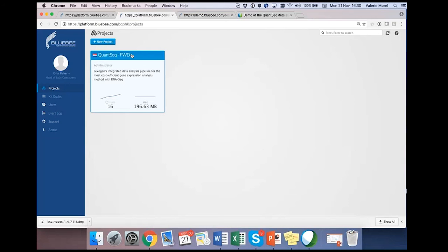Thank you, Michael. Jose is asking which are the default parameters of the pipeline, which genome and which annotation used. I think you already answered this question, but there is an additional part of the question, if there is any reason to use a particular annotation. So we had different testings on the annotation. Usually the RefSeq annotation, which is also quite popular, the genes are usually too short there.